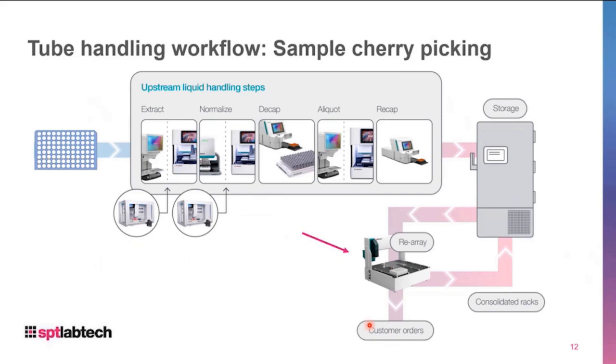And the final couple here on potential more manual workflows, adding a bit of kit as we go, is another example of the Excel here. We have an extraction normalization workflow upstream, probably part of an NGS process, where we go from plates into tubes. The tubes are then put into storage, so we can imagine this being the bulk amount of samples going into the NGS process.